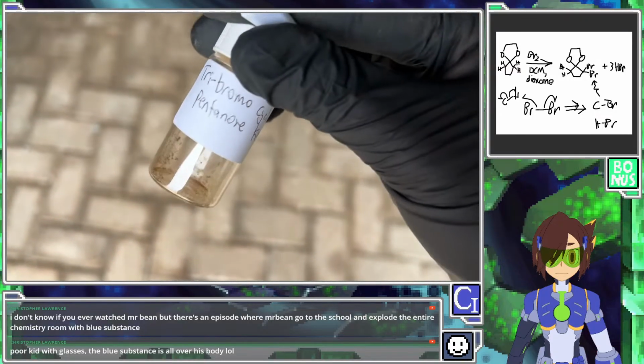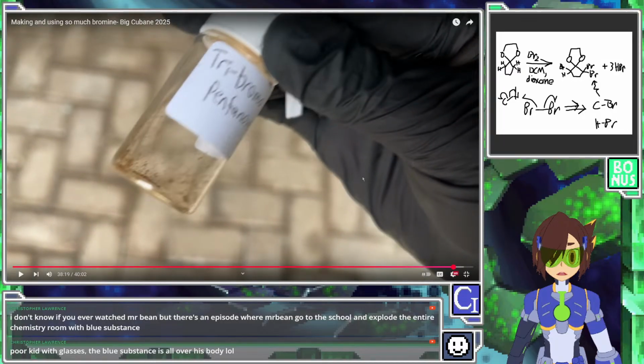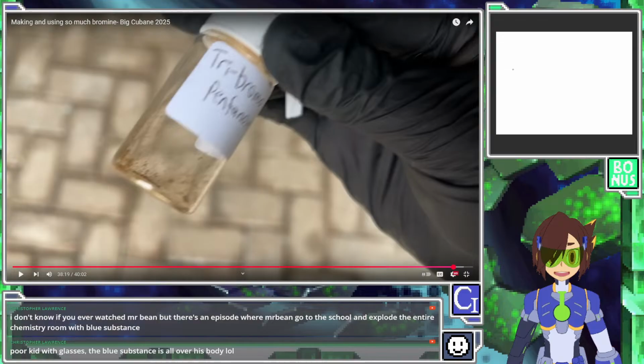I'm going to try crystallizing it out using some seed crystals from this. So for anybody joining, he did do this reaction a long time ago, many years ago on a much smaller scale. And he did keep a little bit of his crappy medium purity product with him. And so what he's going to try to do here is recrystallize the product. Recrystallization is a common method of purification in chemistry where you have a solution that's full of your product molecule. And let's just draw triangles, say. So your product molecule is your triangles.